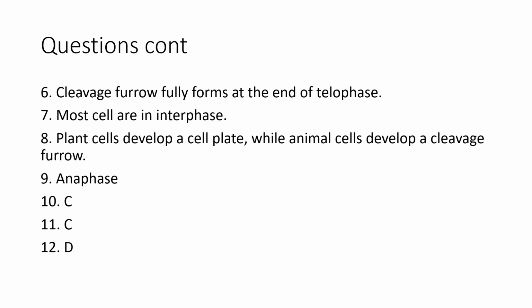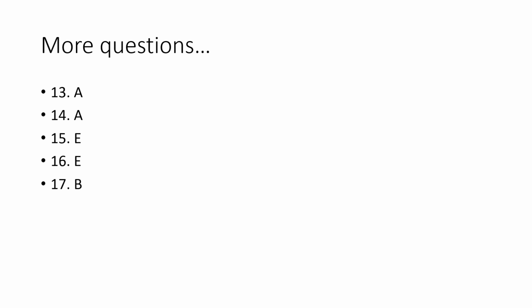I don't remember what the question for number 9 was asking you. Probably something about when do the chromosomes pull apart. That's anaphase, and from there you just have some multiple choice questions, and so you can make sure you have the right answers, and then that finishes all of those nice little questions.